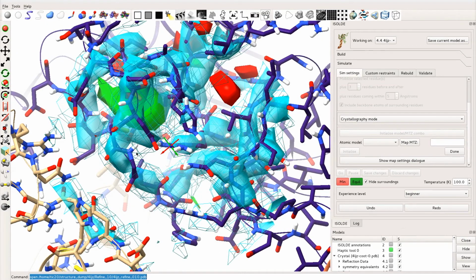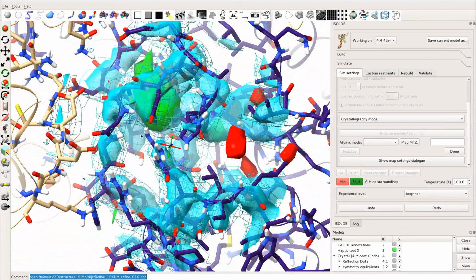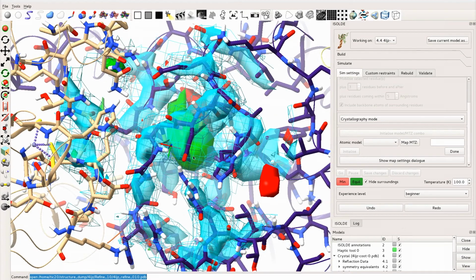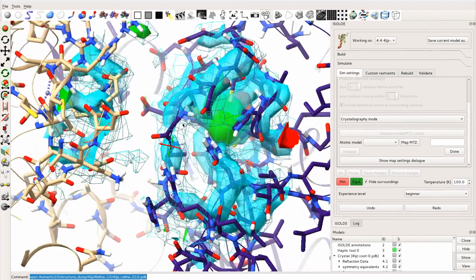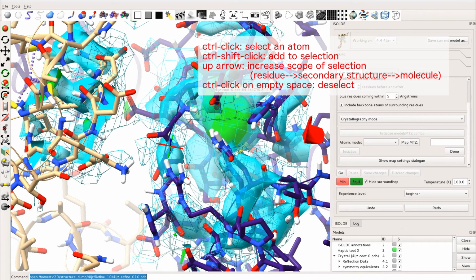These delays are almost unnoticeable in smaller molecules, and should be reduced dramatically with further optimization. All remodeling within Isolde is currently done in the context of interactive microsimulations, typically of no more than a few hundred residues.